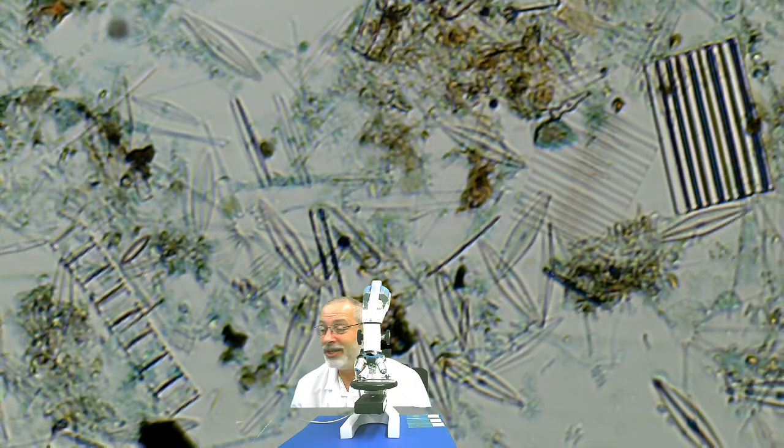And on the ingredients, they're really called hydrated silica. But silica, another word for silicon dioxide, which is sand, is basically what these critters are made out of. So if you need more time, pause the video for 40 times magnification of diatoms.